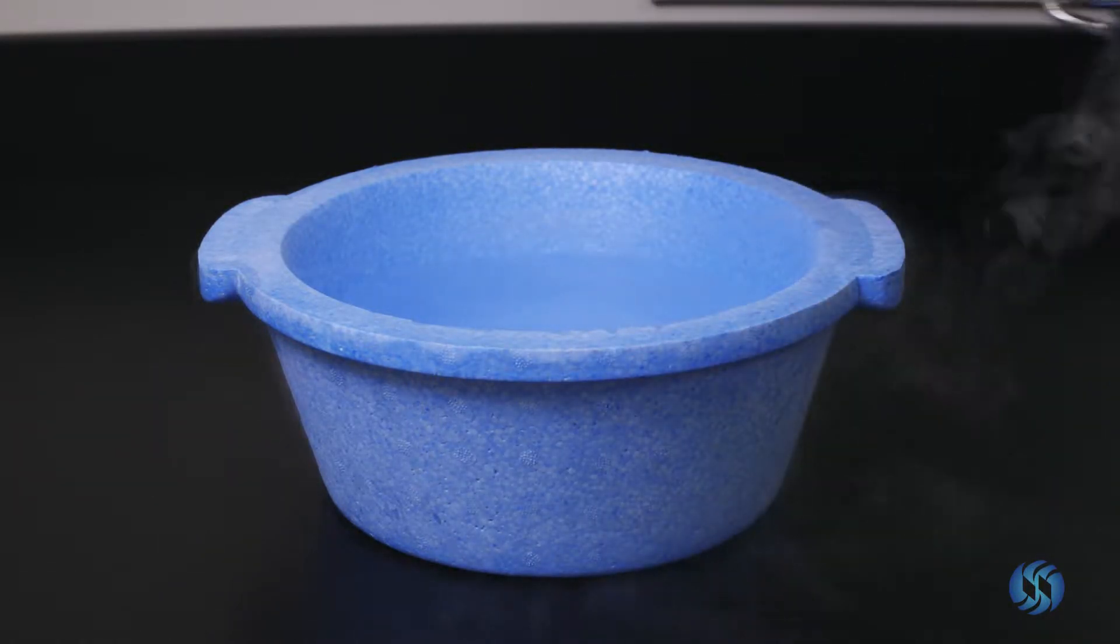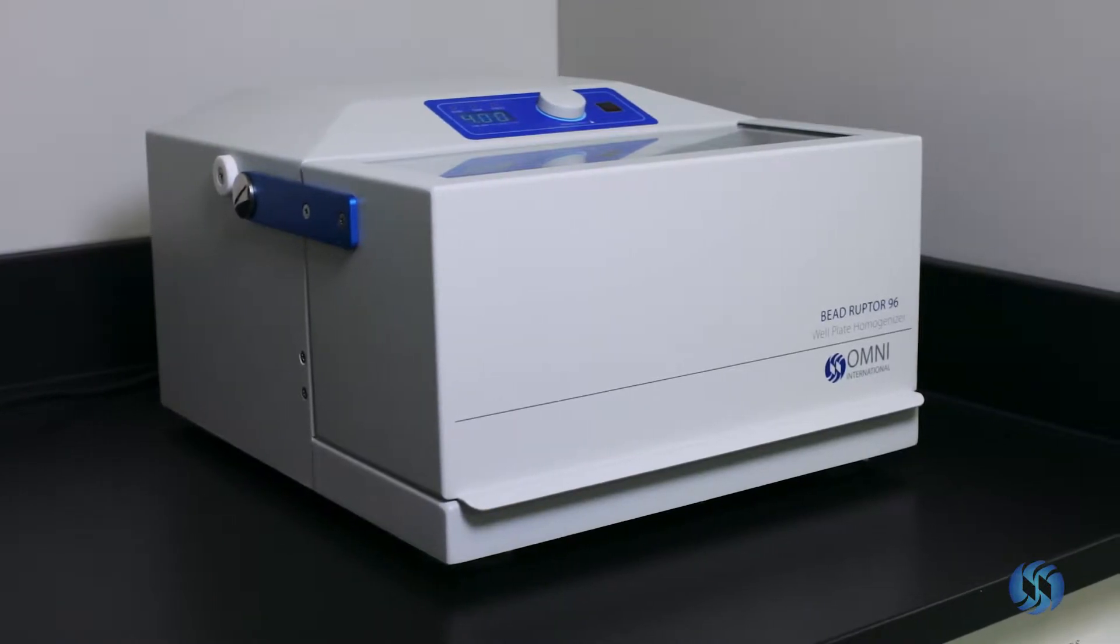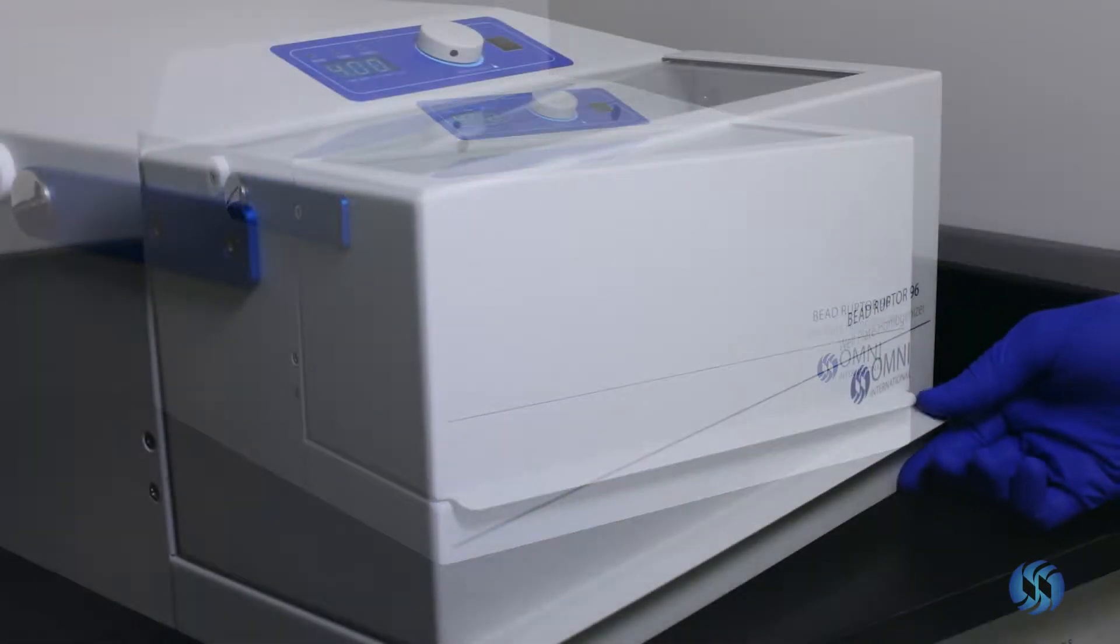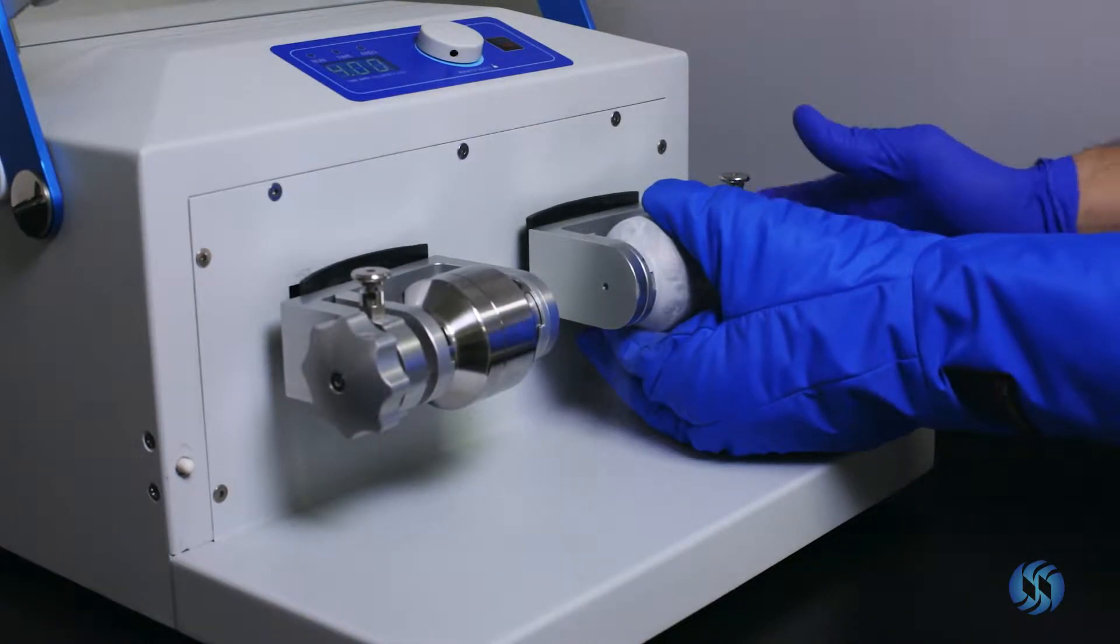Check the jar seal to ensure that no sample contamination has taken place. Place the milling jar into the BeadRuptor 96, fastening the clamp securely.